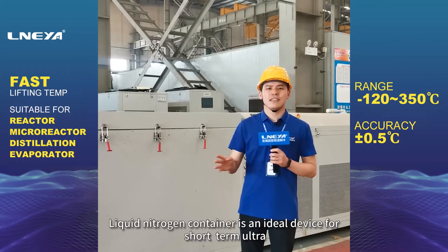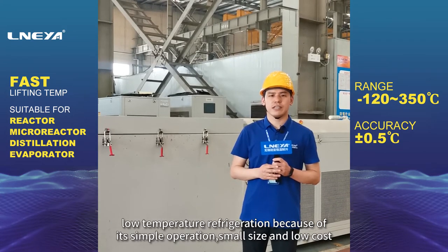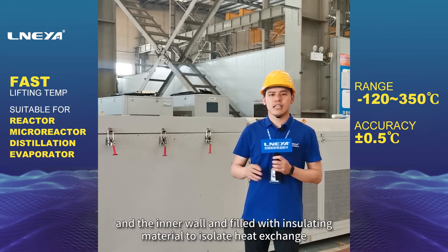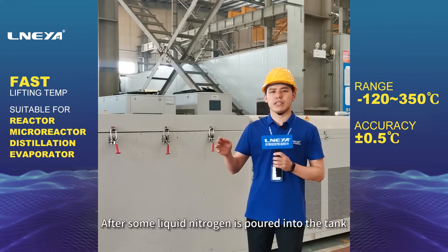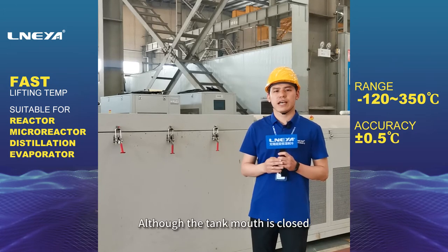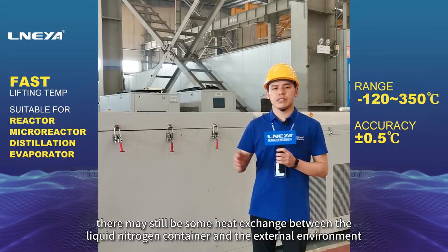A liquid nitrogen container is an ideal device for short-term ultra-low temperature refrigeration because of its simple operation, small size, and low cost. It is a cylindrical container with a vacuum between the outer wall and the inner wall, filled with insulating material to isolate heat exchange. After some liquid nitrogen is poured into the tank, the upper space is filled with low-temperature nitrogen. Although the tank mouth is closed, there may still be some heat exchange between the container and the external environment.